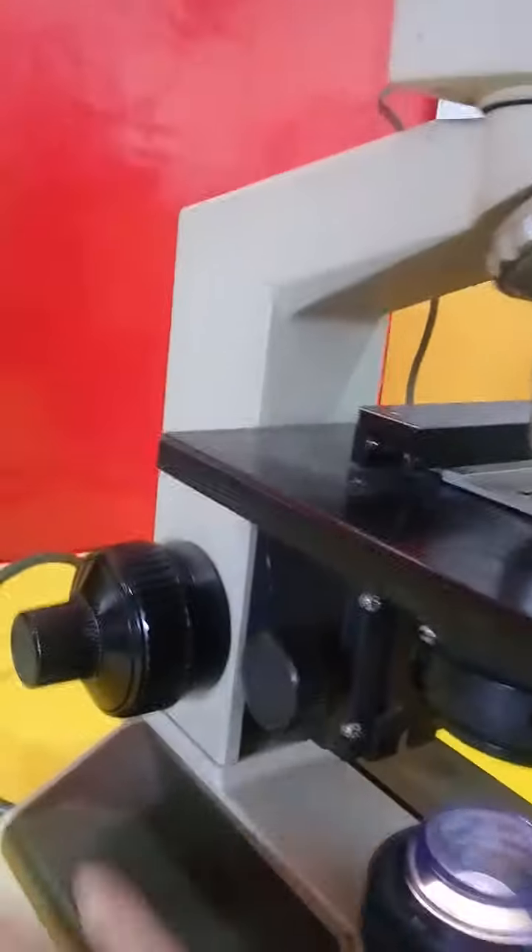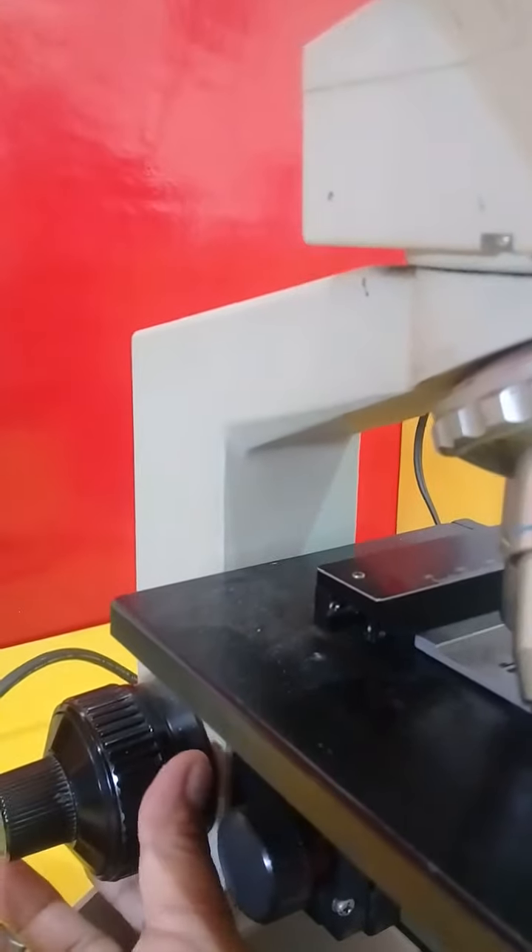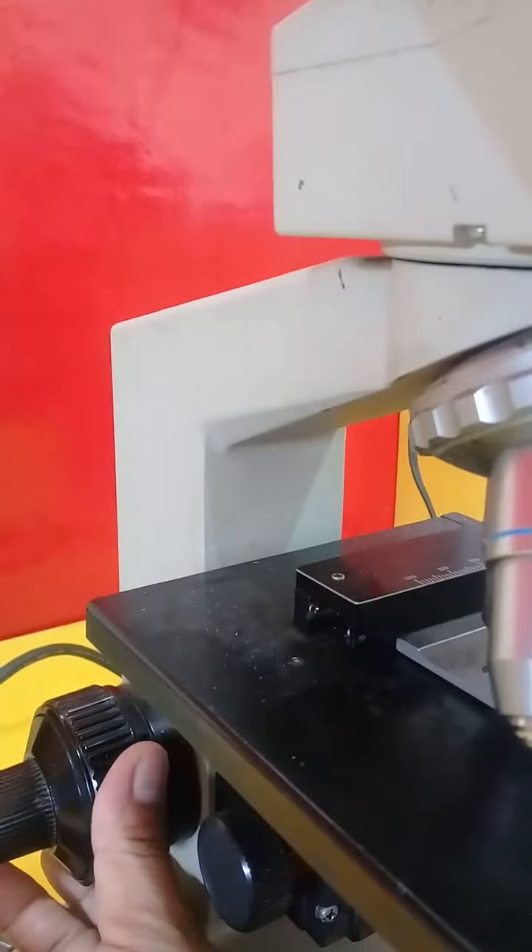So these are the parts of the microscope. This is the arm of the microscope — this is where you're going to adjust. And this is the coarse adjustment knob, and this is the fine adjustment knob, which you can use to see the movement.